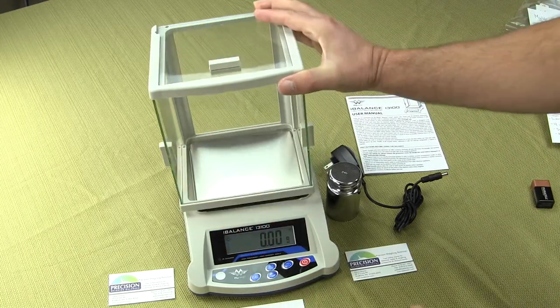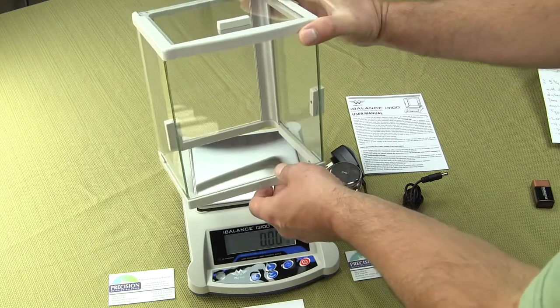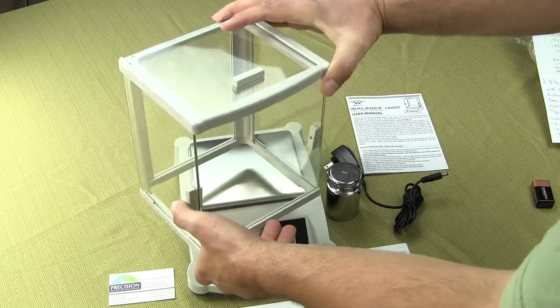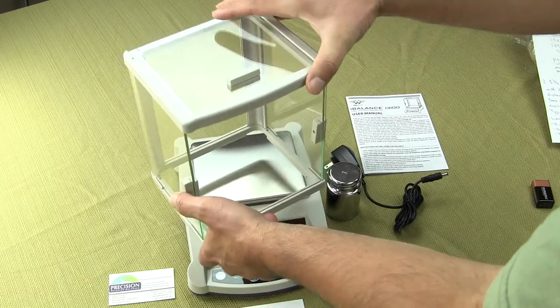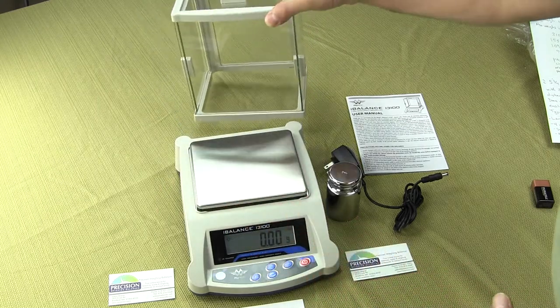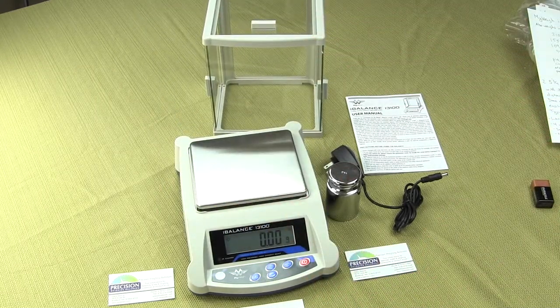The draft shield itself is removable and this is an all-glass draft shield — you have three doors on it. The two sides and the top can be used to access the weighing area. This scale is 0.01 grams, so a lot of people might not use it with a draft shield.